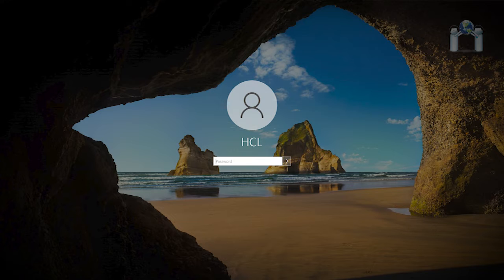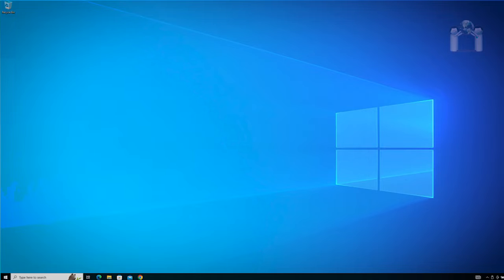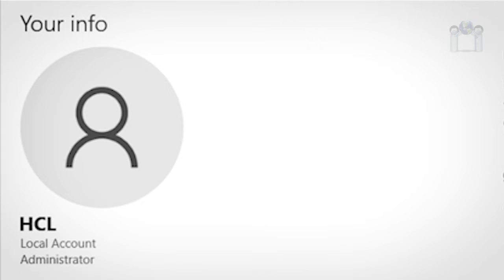To begin, log into a computer that you will use to connect the data logger to. Make sure a USB port is available and the computer is running Microsoft Windows. Also, make sure you have permissions on the computer to install software.